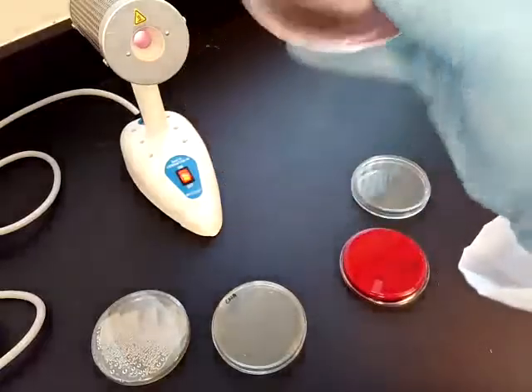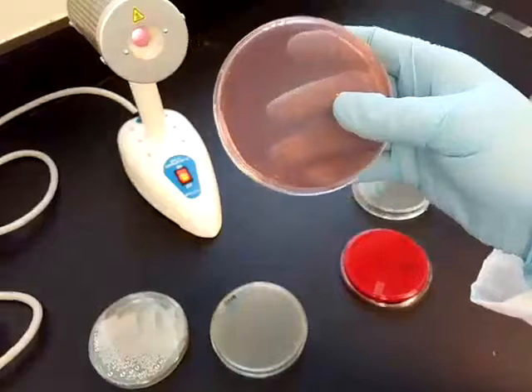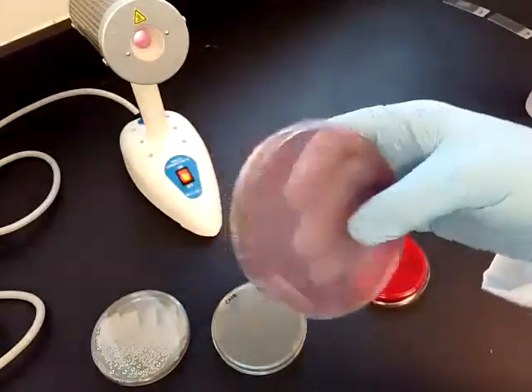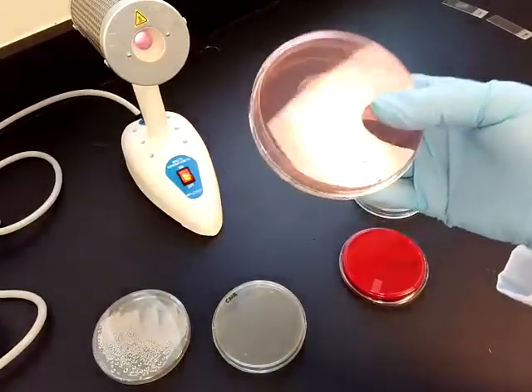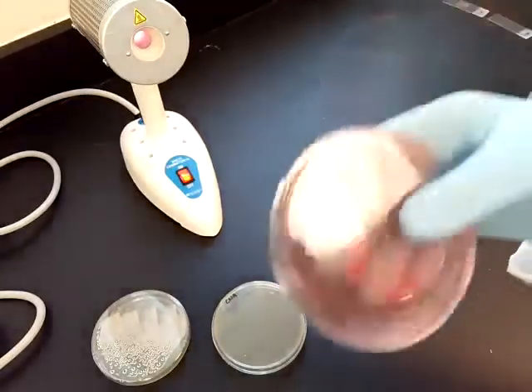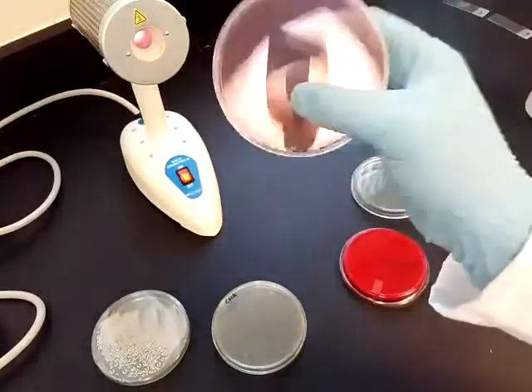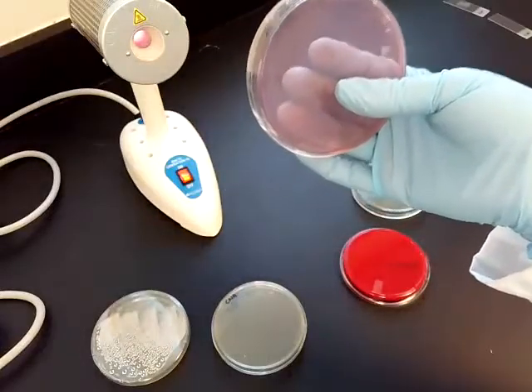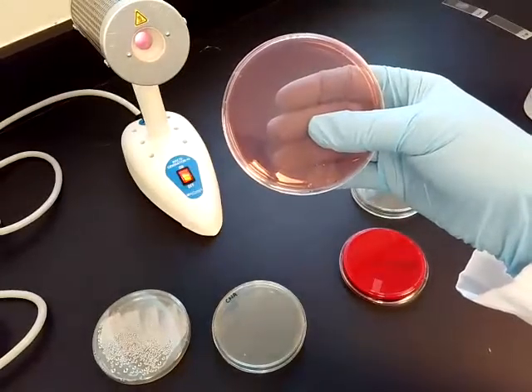So when we grow digestive samples, fecal samples, that type of microorganisms on this plate, it's going to kill off the good guys because we don't care about the good guys, and it only grows the bad guys. So that kind of reduces the number of microorganisms that we're looking at, so we can identify what's causing the diarrhea or what's causing the abdominal upset and that type of stuff a lot faster. So it's selective because it contains crystal violet and bile salts that are going to select against those gram-positives, and then it's differential based on lactose fermentation.